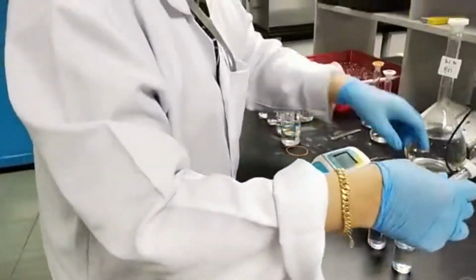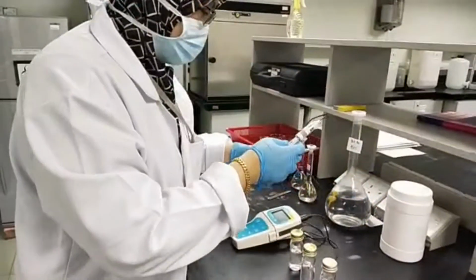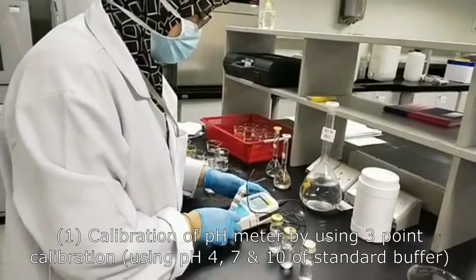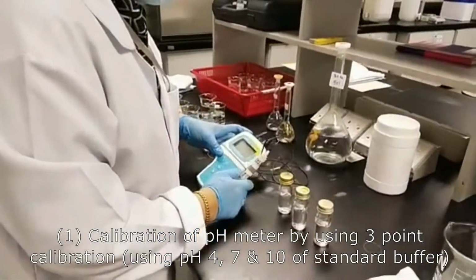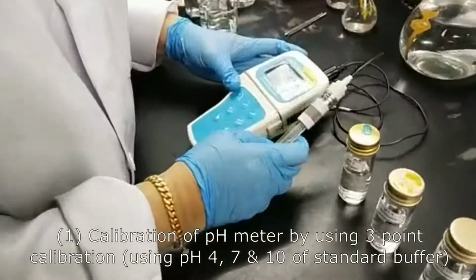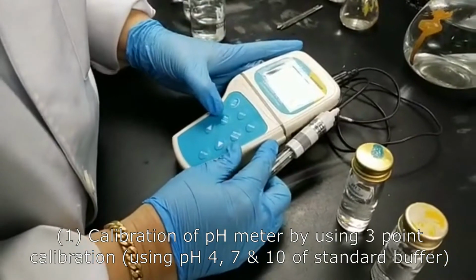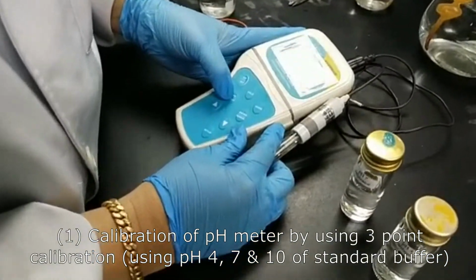Okay, so hi everyone. I'm going to show you how to calibrate the pH meter. We have a portable type pH meter. This one is quite simple. We have to use the mode for calibration. This is calibration.